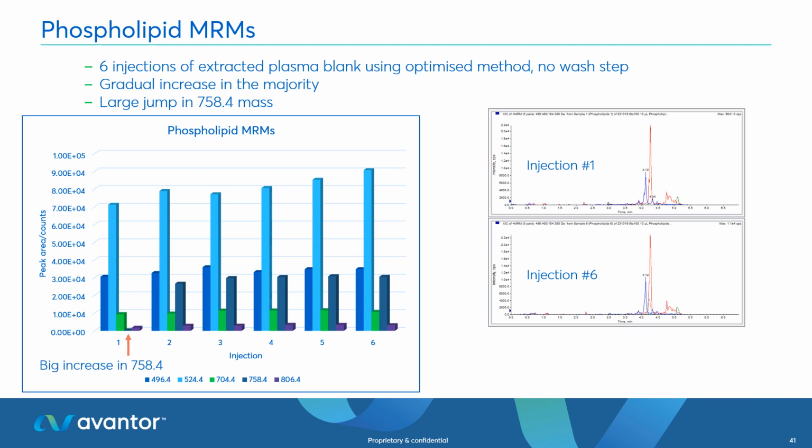And this may relate to some of the chromatography that we're observing. When we optimize the chromatography, we optimize it for the analytes. We've optimized it in this case for the 20-mer thymidine oligonucleotide, and we haven't optimized it for matrix components. Consequently, it's highly probable that some of these matrix components may not elute in that first injection. And I think that this is what's happening here. So we get a buildup of compound on the column, and they come off. Clearly, we need to do some further optimization on the wash steps, and that will come in a subsequent webinar.